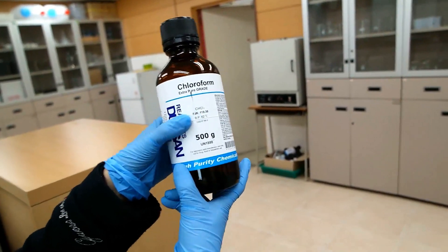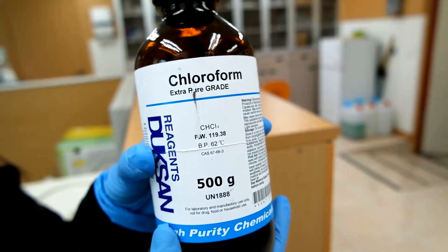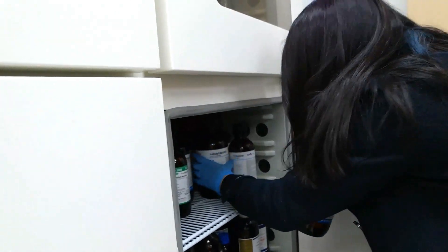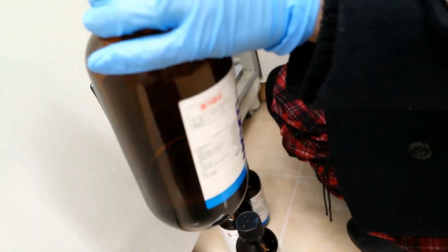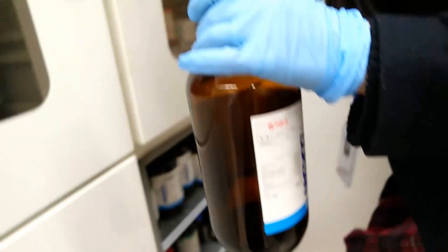Do we need CHCl3? Or was it tetrachloromethane? I think this is tetrachloromethane. Let's use hexane because we need a non-polar solvent.